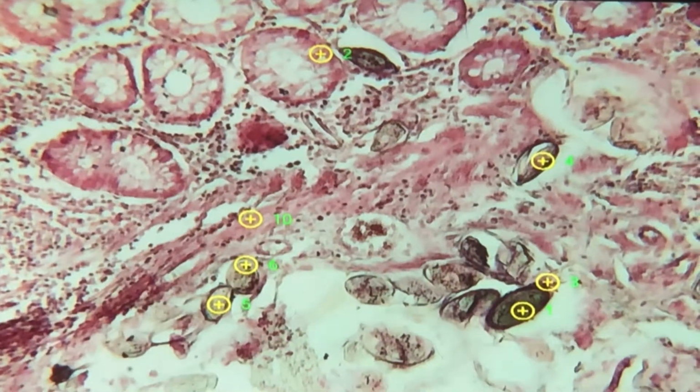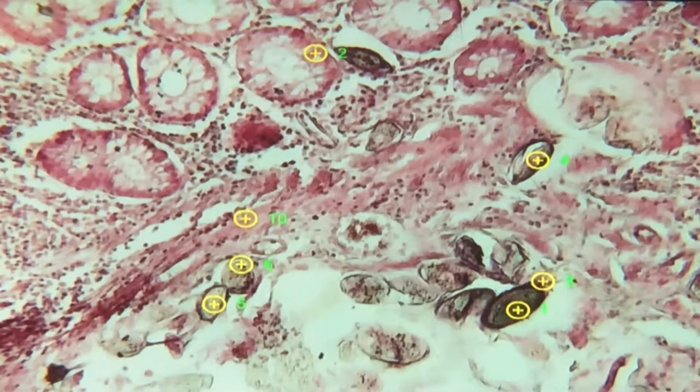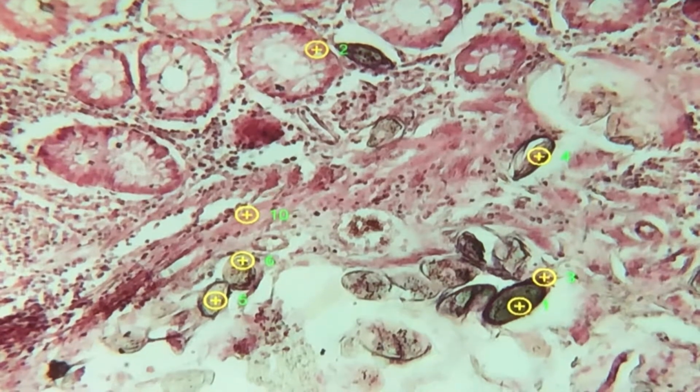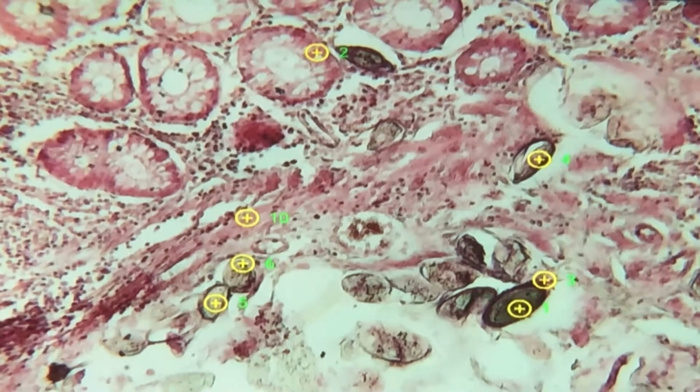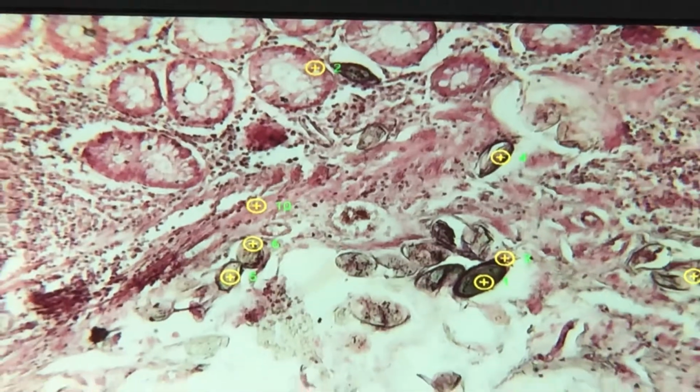The small round portion with the red cytoplasm, that is an eosinophil. It is a very taggable structure also. So I will let you scan in high power so that you will appreciate the eosinophil.